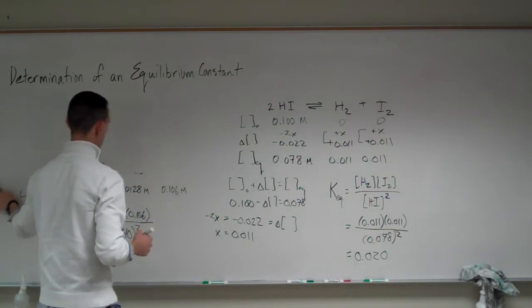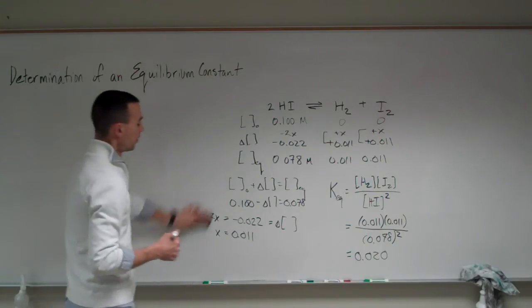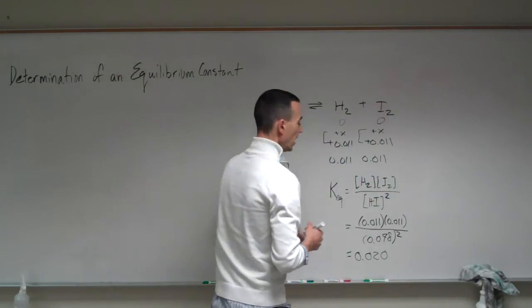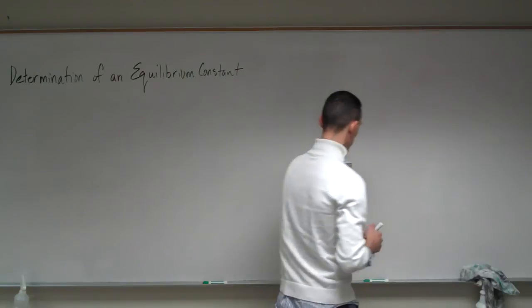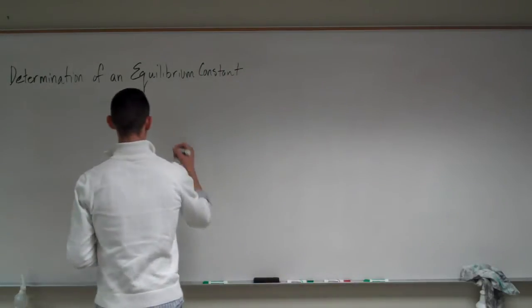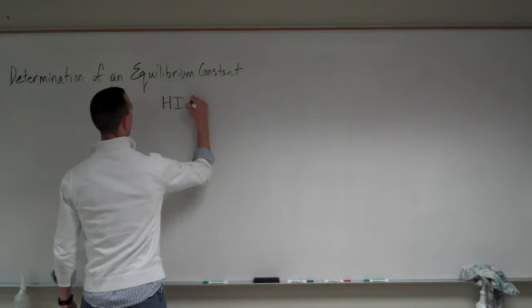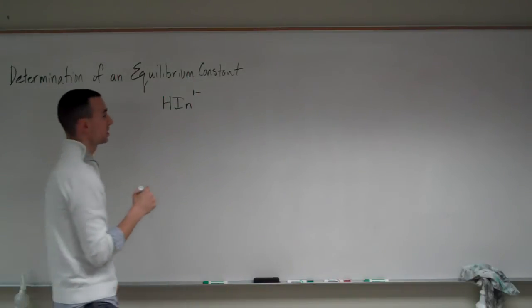So what's today's reaction? We're going to be looking at an indicator, an acid-base indicator. And the formula is quite complex, so I won't use the entire chemical symbol to show it on the board. But we can treat our indicator as HIn, and it has a 1- charge on it already. It's been put into solution.